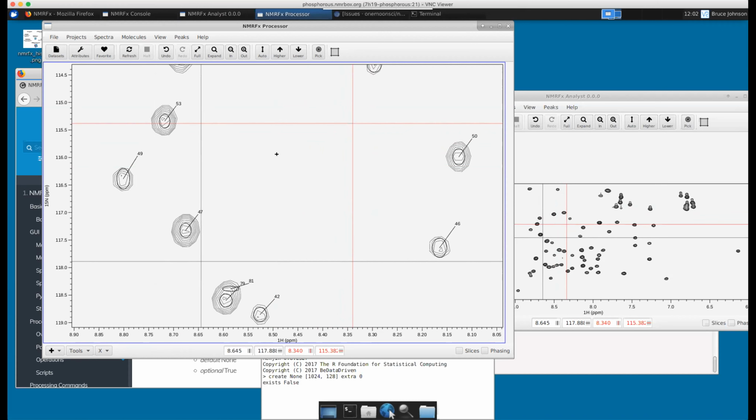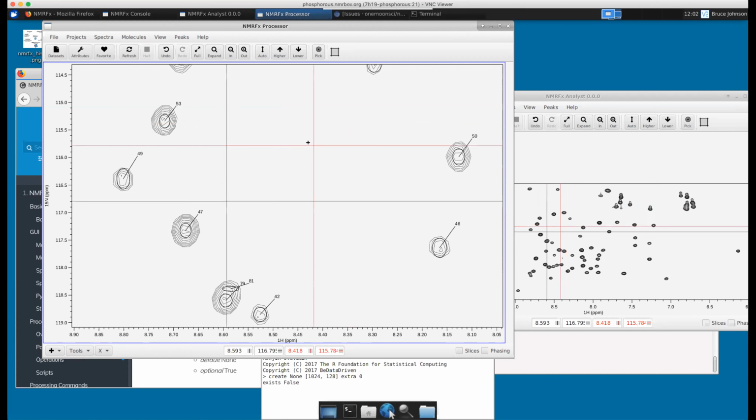There are a whole series of shortcuts, which should be documented. There is a shortcut, C1, that puts you in single button crosshair. I'm just typing these keys, you don't see anything. CS would toggle me from the crosshair to the selector cursor, and CC would put me back in the crosshair cursor. C3 puts you in 3-button mouse mode, C1 in 1-button mouse mode. So you can toggle between them all.